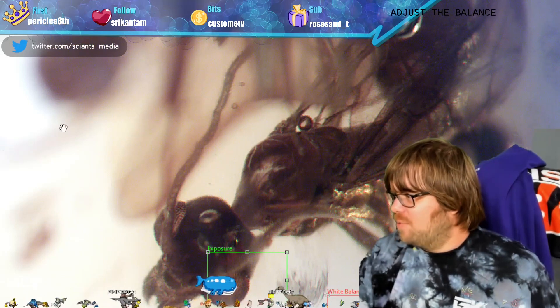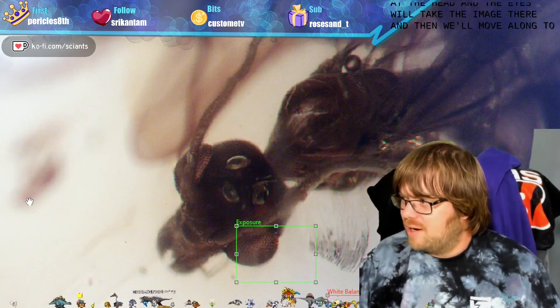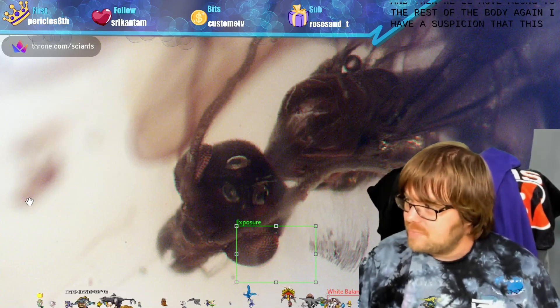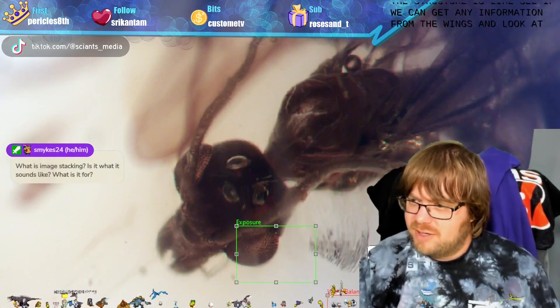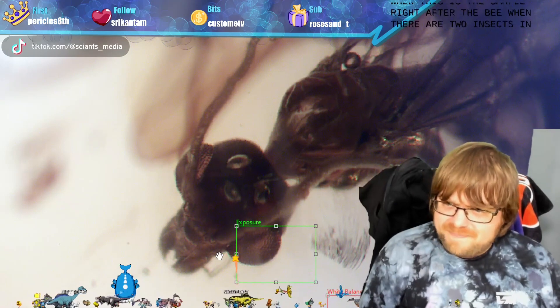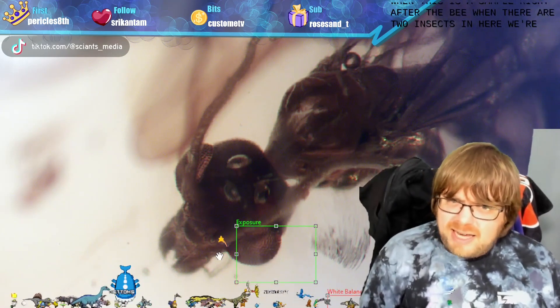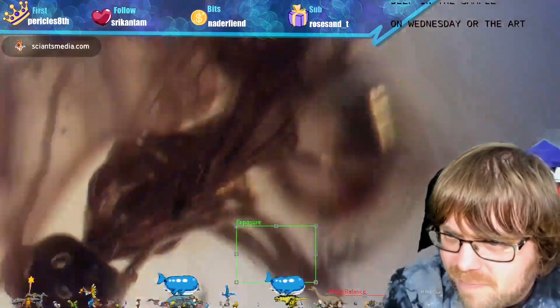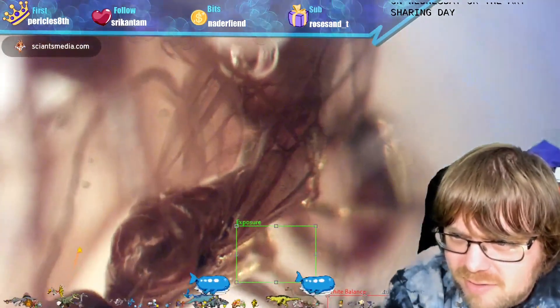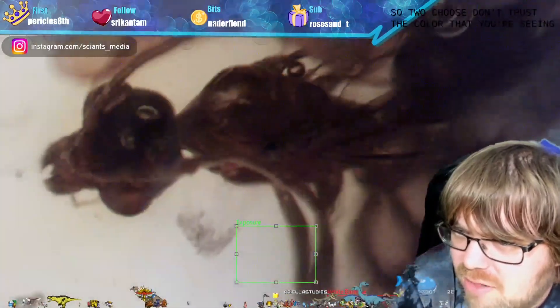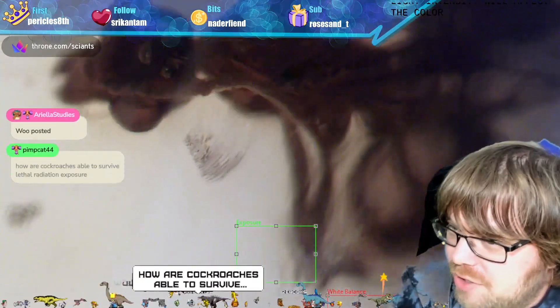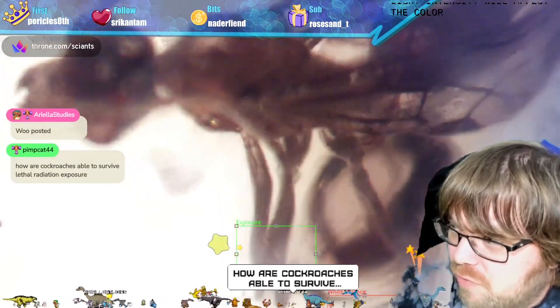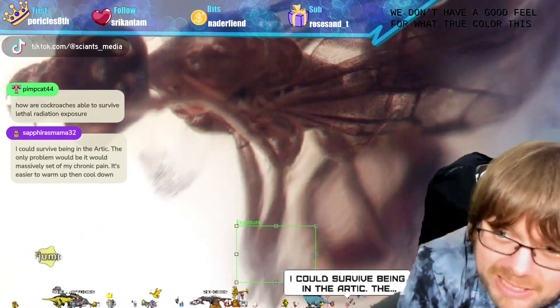This is a beautiful sample - the colors are really nice. Moving along to the rest of the body, I have a suspicion this is a queen. I'll need to look at the abdomen, see what the structure is like, check the wings, and look at the other individual. Don't trust the color you're seeing right now - this is color adjusted, not the true color, and it changes with light intensity. We also don't have a good feel for the true color because of how yellow the amber is.